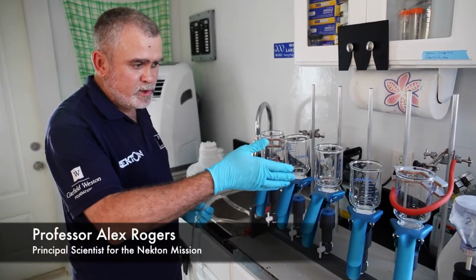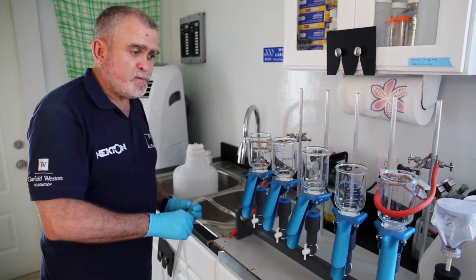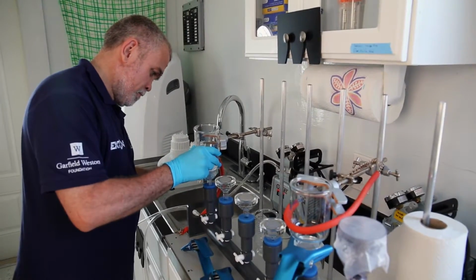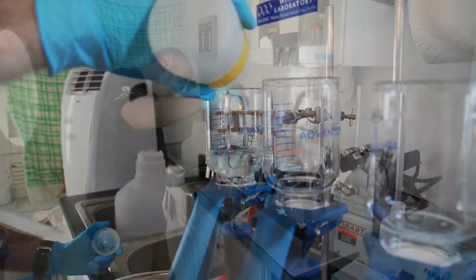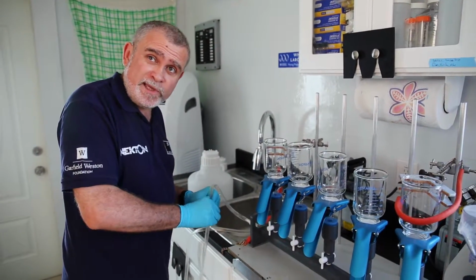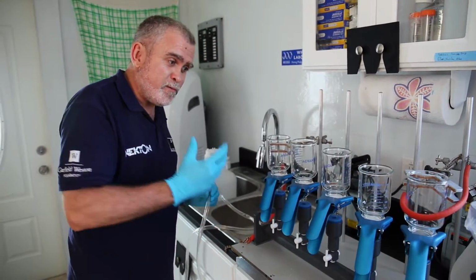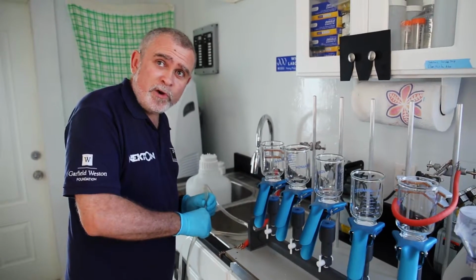What we're doing is just drawing seawater samples through glass fibre filters, and that's retaining all the tiny bits of animals and algae that may be in that seawater sample. And then I'll freeze the filters and we'll actually do environmental DNA work on those. So it's a new way of assessing biodiversity basically in the environment.